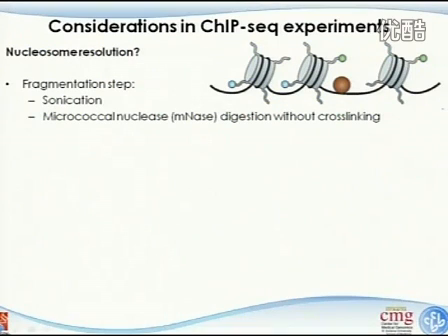The first one is so-called sonication. Basically, you use ultrasound to give additional pulses to the sample, and it will be broken into smaller pieces. The size of the fragments depends on how often you do it and how strongly you do it. The biologists in the room probably know that machine pretty well: you put in a tube and so on. I saw that in Dr. Edinburgh's lab all the time. But that's one way to physically break it into smaller pieces.